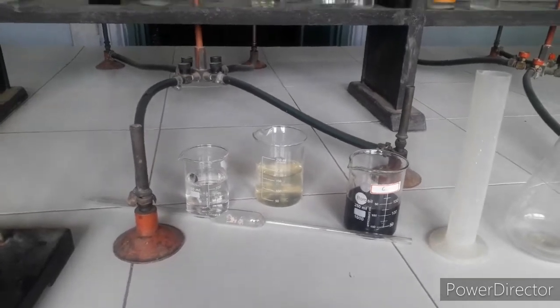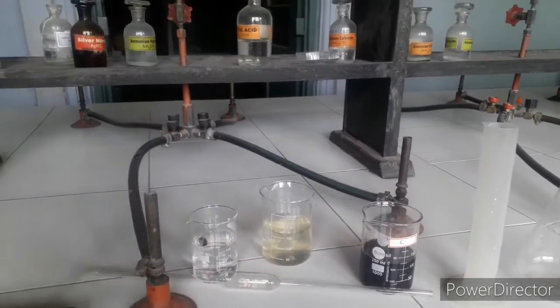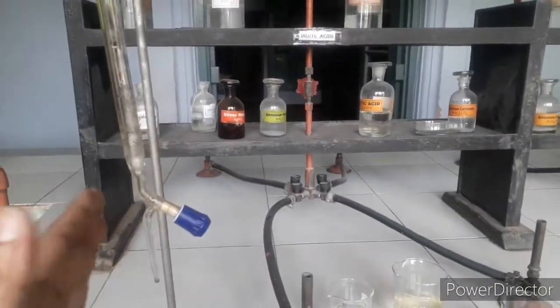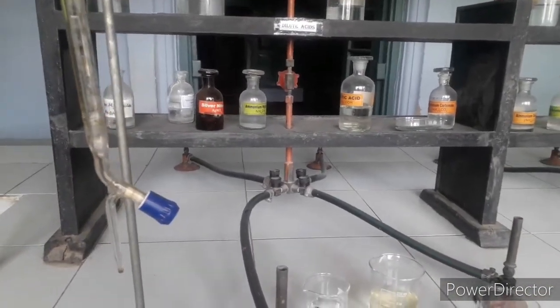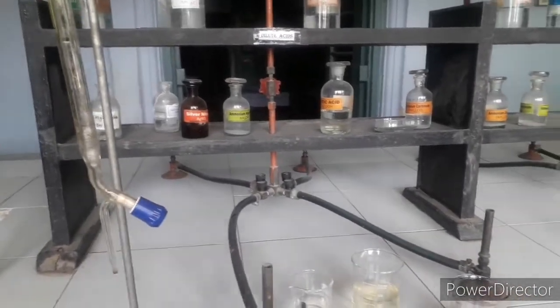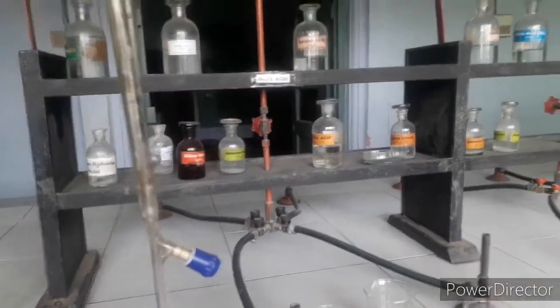The procedure is already given in your question paper. What I'll do first is fill the burette with KMnO4. Before filling, you must clean the burette — it has already been cleaned with distilled water and also with a small amount of KMnO4 solution.